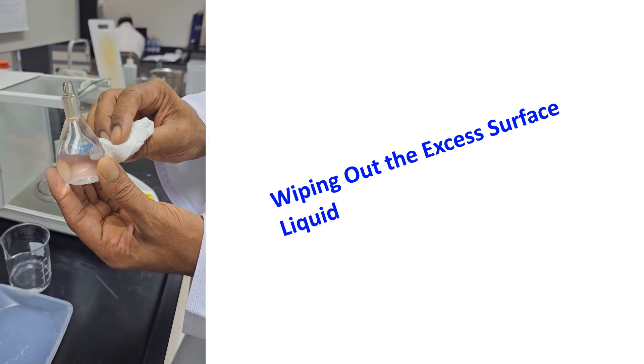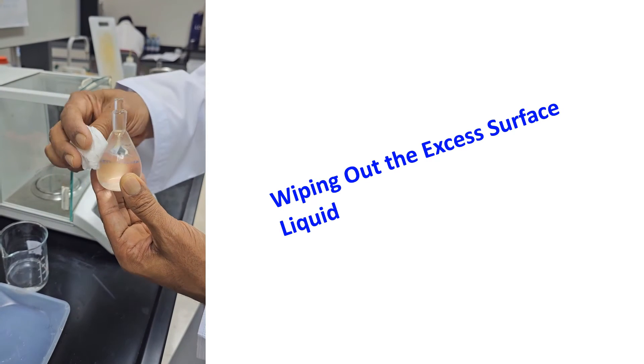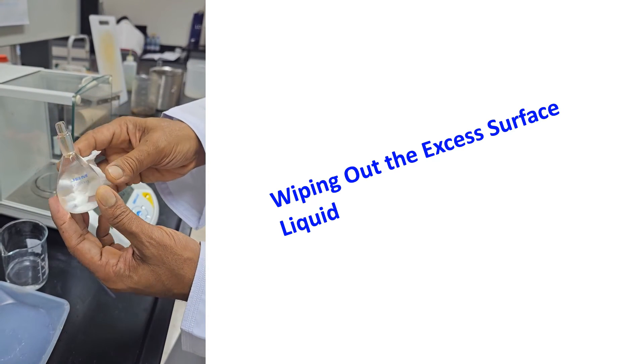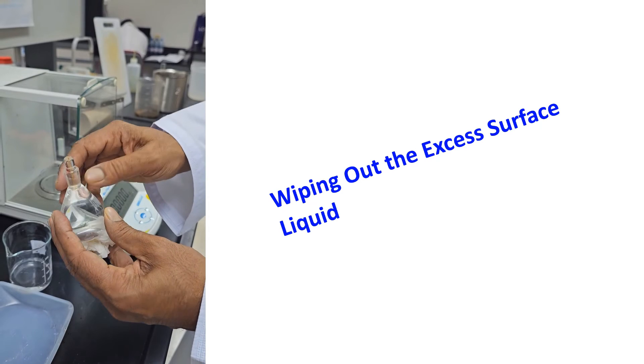We are now wiping out the excess liquid on the outer surface of the specific gravity bottle. Soft tissue papers are being used.